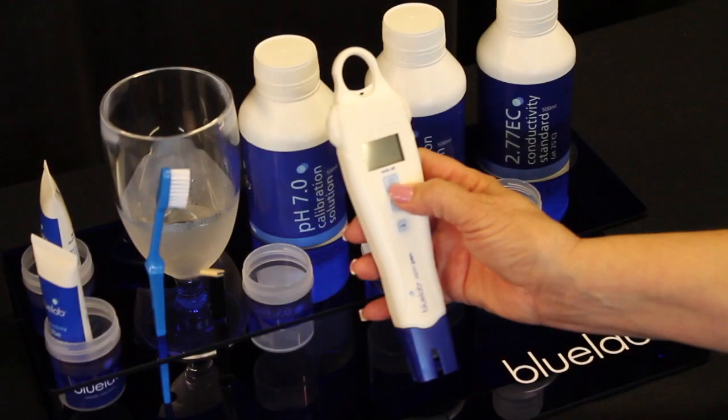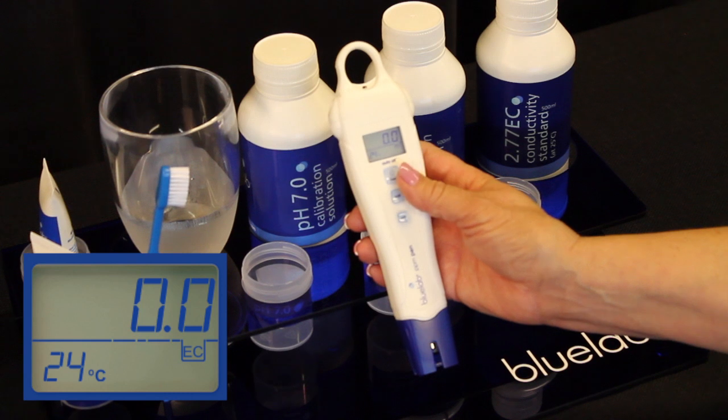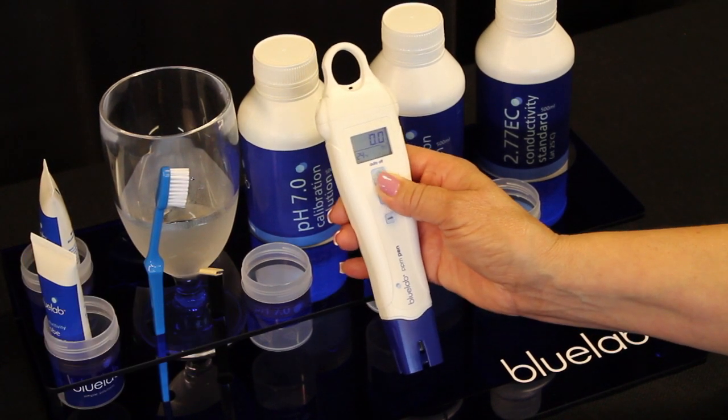Turn your Bluelab PPM pen on by pressing the power button. This pen has a backlit LCD display and has a hold reading function for easier reading. One short press of the on/off button to make it hold, and once again to take it off hold.